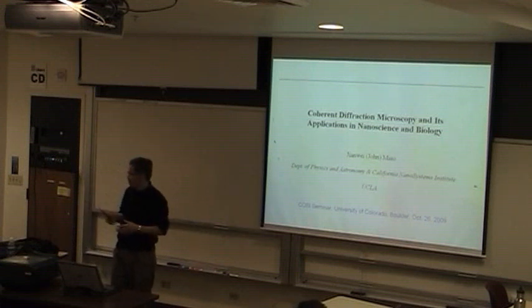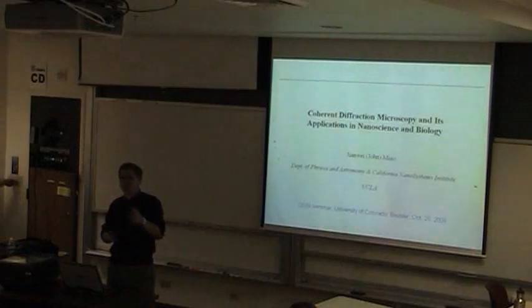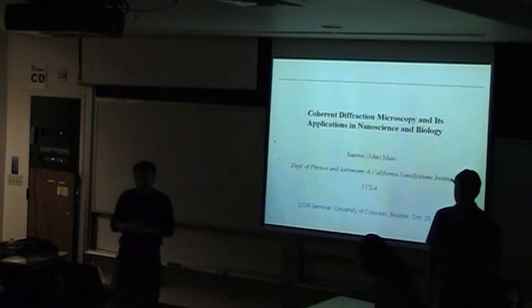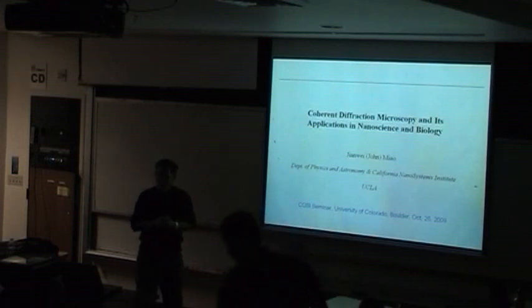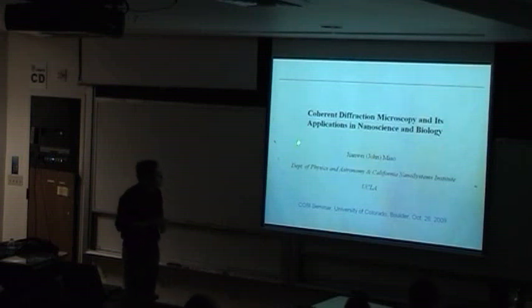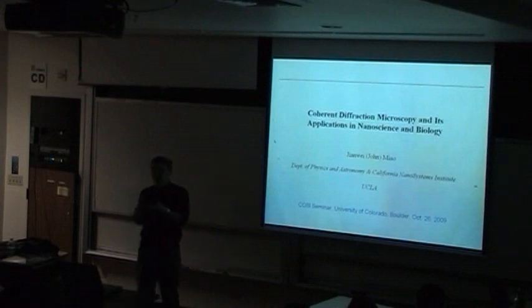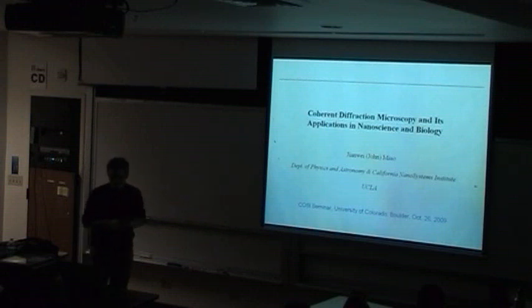First of all, I want to thank Margaret, Henry, and also Ario for inviting me to be here. It's my second time in Boulder, and I also brought the sunshine from California. I'm going to talk about a technique that I have been working on for more than 10 years. Actually, I started when I was a graduate student. It's coherent diffraction microscopy and its application in nanoscience and biology. I'm especially interested in coming back to Boulder because I have long-term collaborators. Margaret and Henry have collaborated with me for a few years and have been very productive. I'm going to show some of the results that we worked on together.